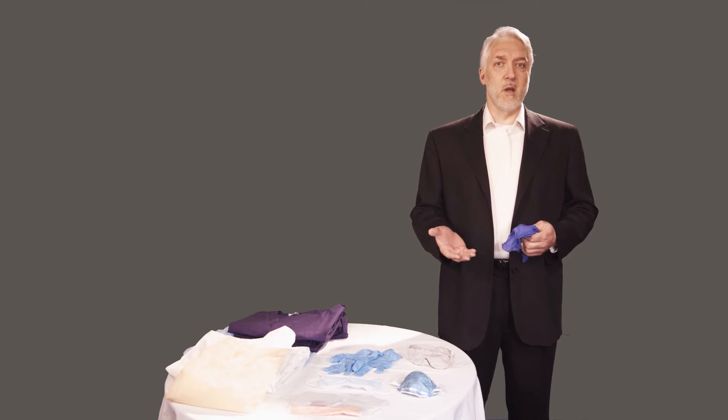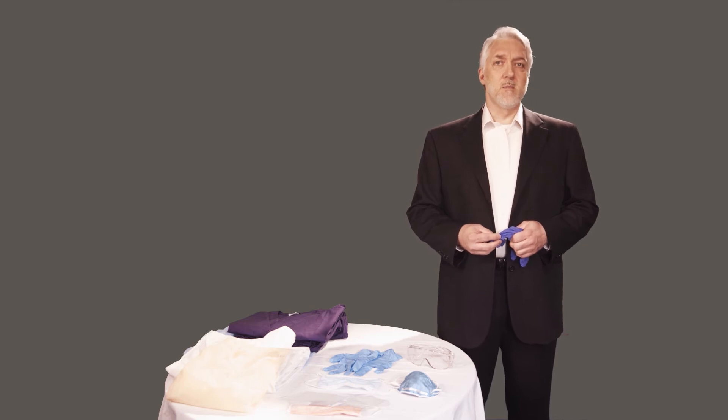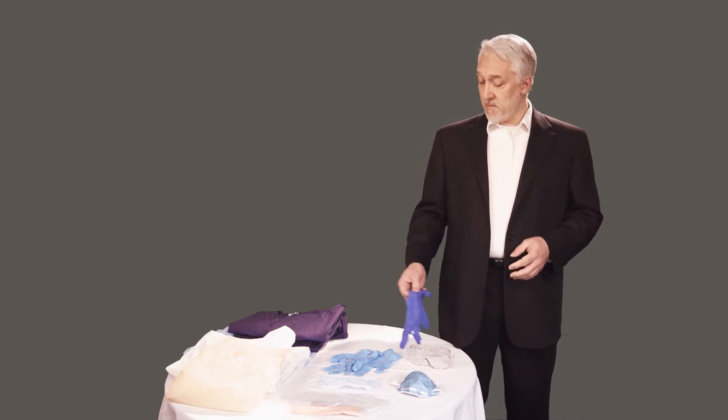Using gloves has a special emphasis in the standard. Wear them if you can reasonably anticipate that you may have hand contact with blood or other potentially infectious materials. This is especially important if you have non-intact skin. You must also protect your eyes and mucous membranes if there is a hazard of splashing.